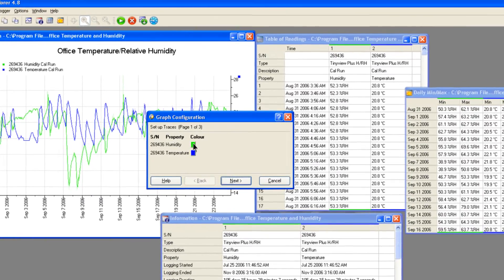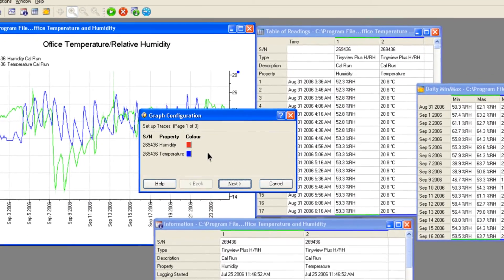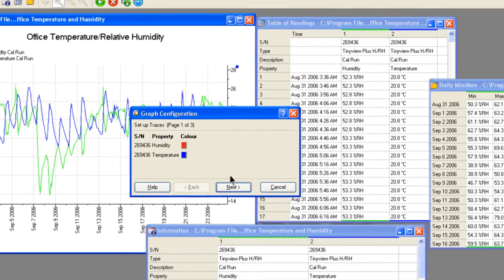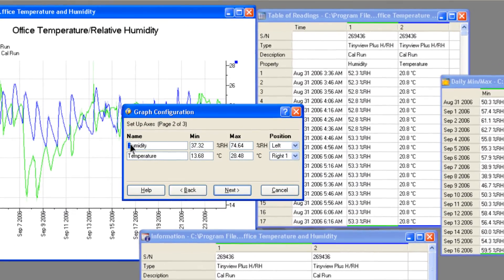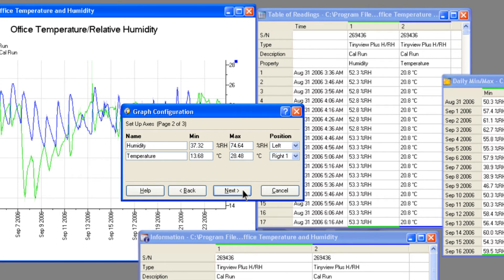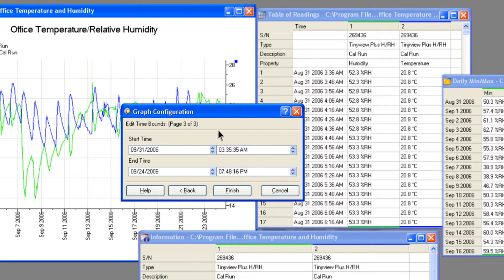Aspects of the graph view may be changed, such as the color of the traces or the name or scale of the axes.